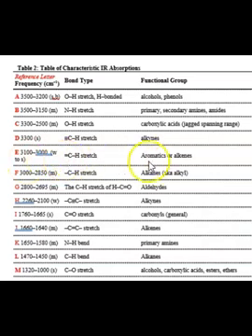But I want to point something out here: we do have an alkene, that's a C double bond, but also remember that benzene rings, or six-sided cyclic structures, if they have alternating double bonds, we call those aromatics. So you have to pull back some of that knowledge that you have on naming of chemicals.